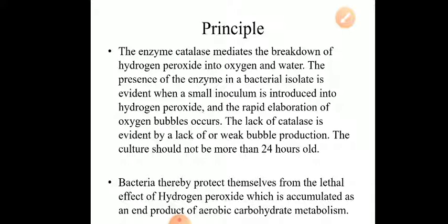A small amount of culture is immersed in or allowed to interact with hydrogen peroxide, and if there is rapid evolution of gas bubbles, effervescence, we are sure that the organism is catalase producing, catalase positive. If the organism is not able to produce the catalase enzyme, there will be no bubble formation or very weak bubble formation. But we have to make sure that the culture is 24 hours old.